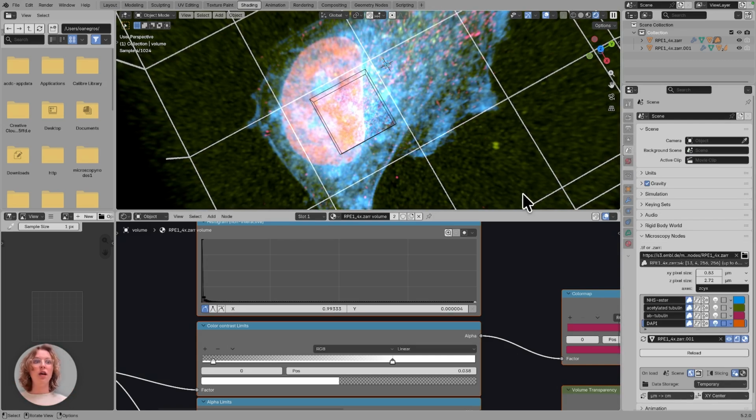Please note that every single mask you make will take the voxels of the scale that you're currently at. So if you do the reloaded voxels from already a really large size, it might be a little bit heavy. So I would always recommend, if you want to rescale your mask a lot, you go intermediately to a low scale and then go back to your high scale.